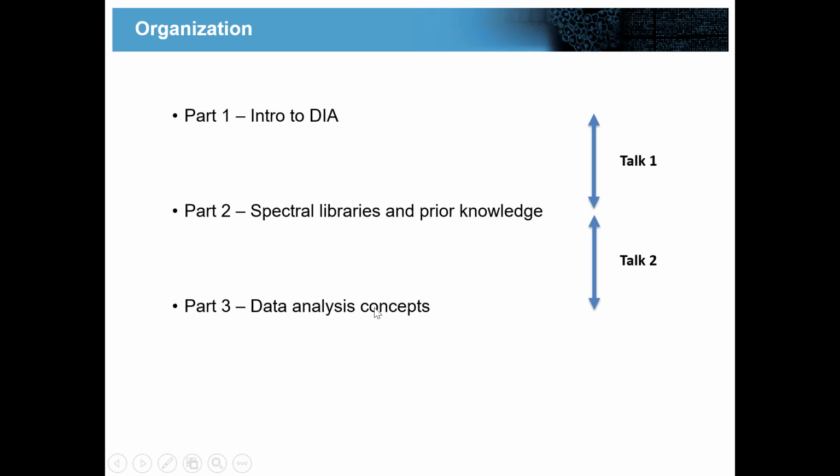And then part three, which in the scope of this course is going to be very important, is the data analysis concepts and the low-level details of how we do the data analysis: the signal processing, scoring the data, and false discovery rate control, as Rudy mentioned in his talk. That's going to come tomorrow. I hope splitting this across two talks is not too incoherent, but I thought it was more useful to keep the high-level structure of these three lectures separate.